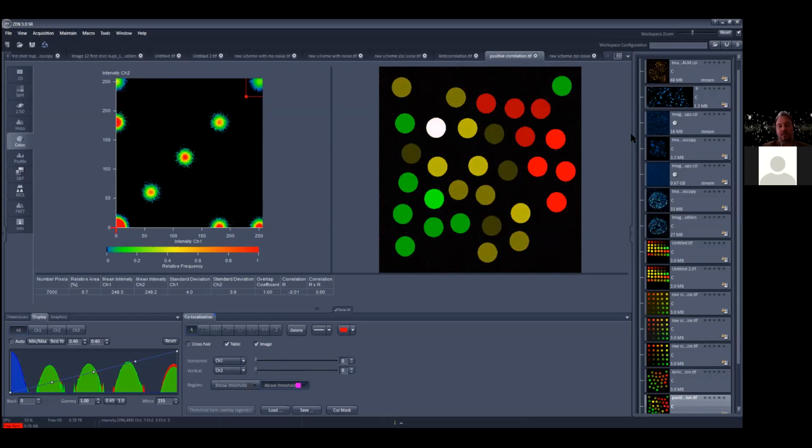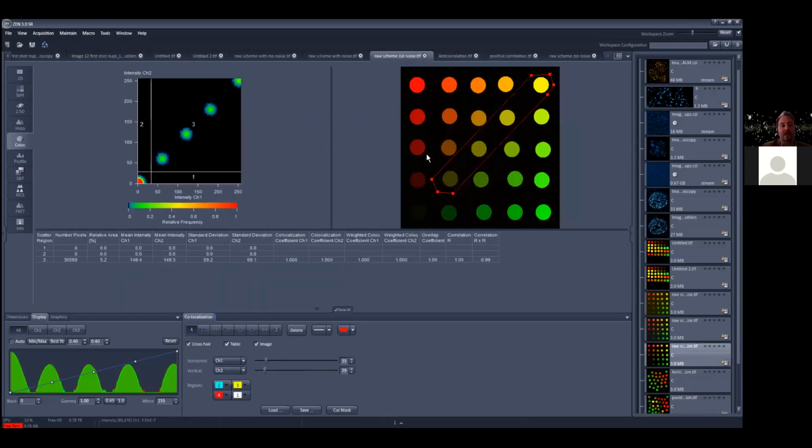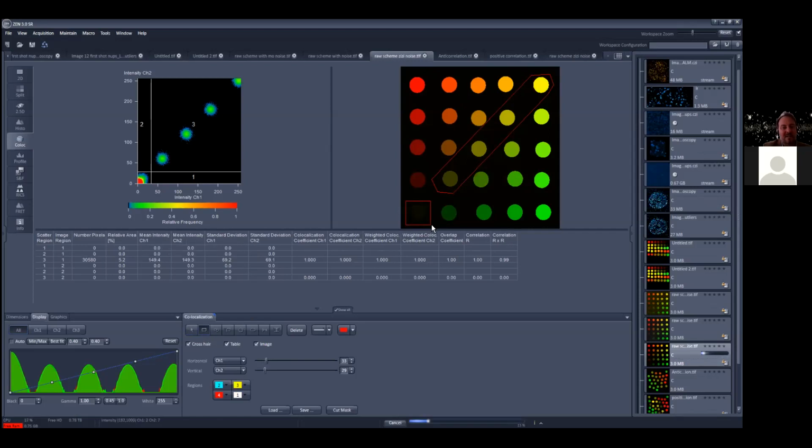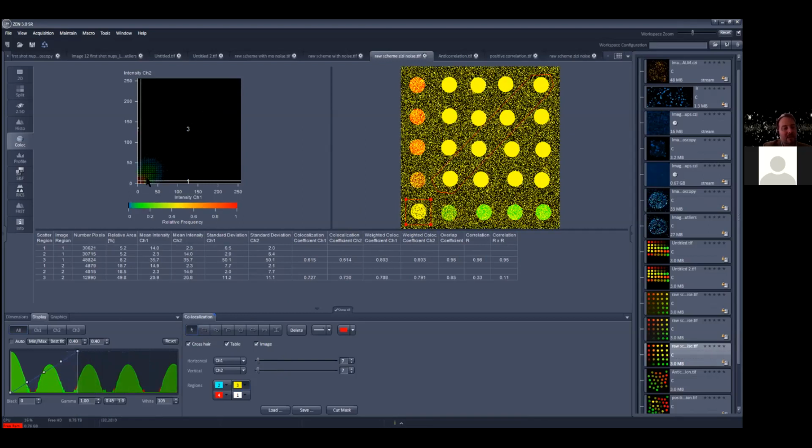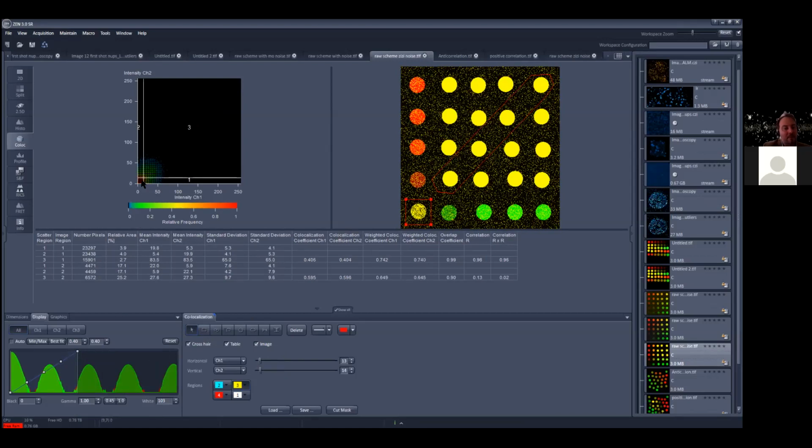Yeah, we can also, hold on, we can also go back to this first example here and ask the question. So remember this, there was this other object down here. Right, you can almost see it here, like that. Yeah, that this little cloud here, the red part of the cloud down there, maybe I can increase this. It's difficult to see here, but that red part of the cloud down here is the real background, and that part over here is actually that very dim object that we saw over here.